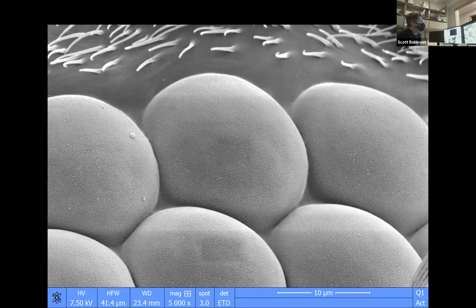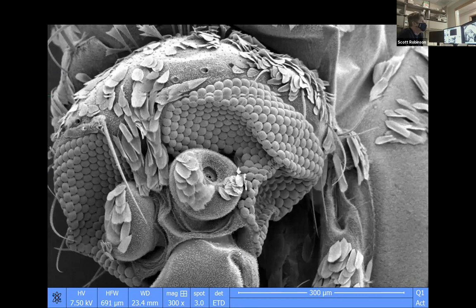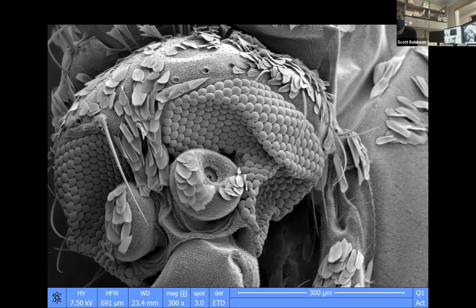And if this mosquito was still alive, its eye would not be collapsed like this. The eyeballs, instead of being all shrunken like we see right now, would be round. What that means is that if you're a mosquito, you have almost a 360 degree view. And that's really helpful because the life of an insect is really fast. When they're alive, everything happens really, really fast. So you have to be able to see what's coming at you, and you have to be able to go and see what it is that you want to find.